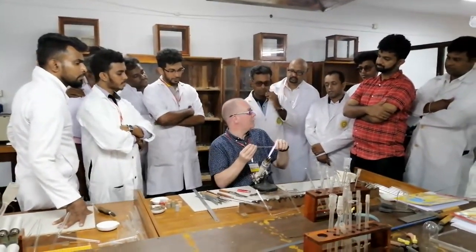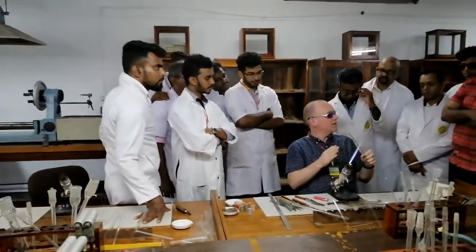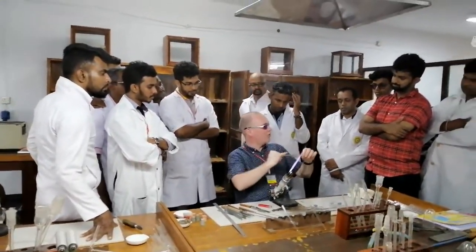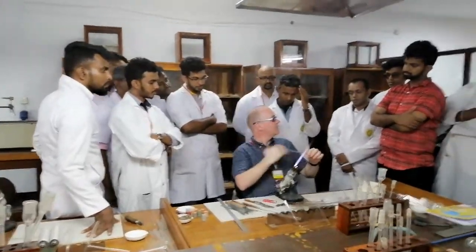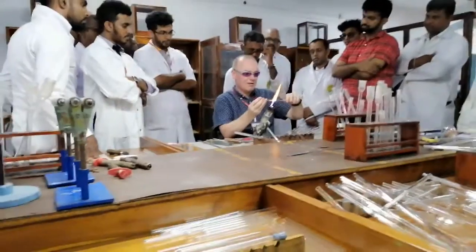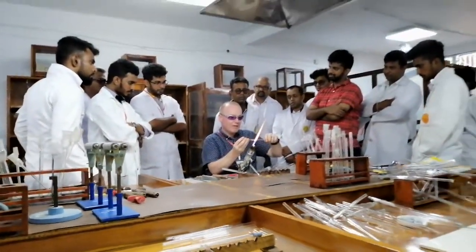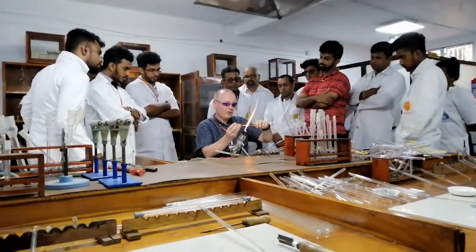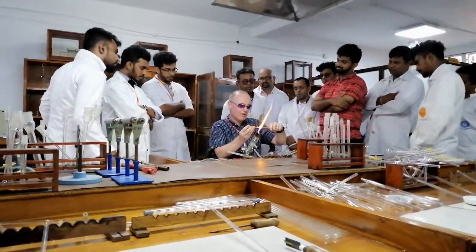Now, the test to see how good you've done it is to do another one. Because if this is now not straight, the next one is going to be harder and harder. We'll have a competition and see who can do the most nice ones in a row.